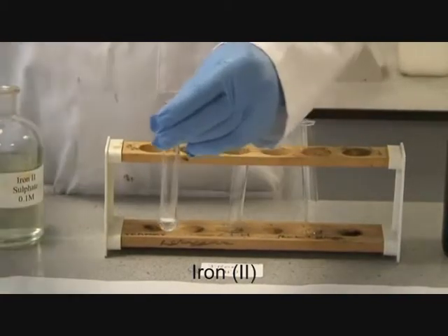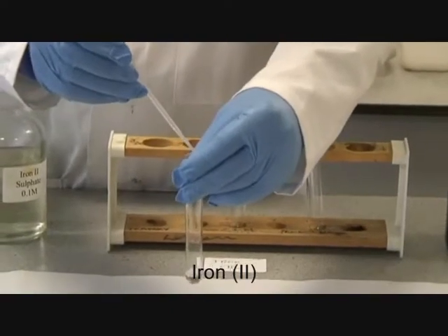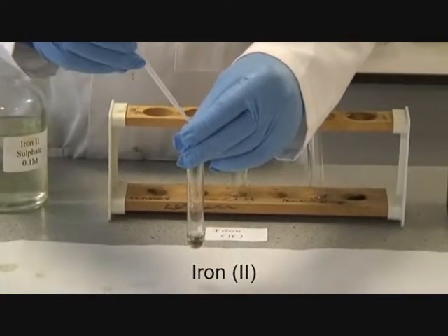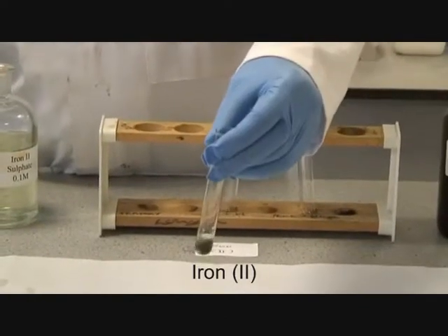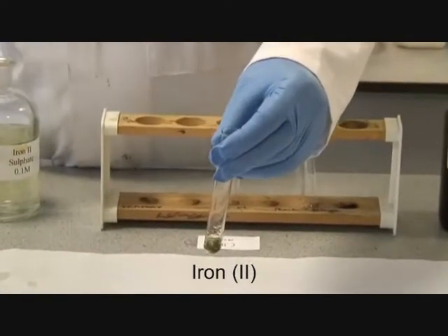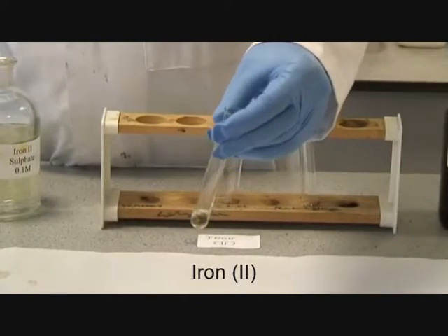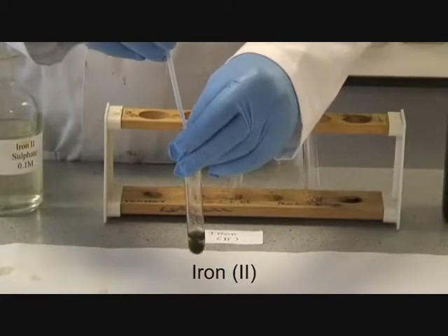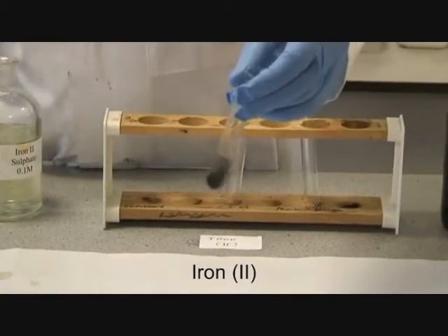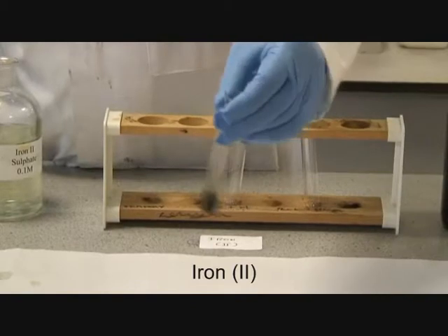On the addition of hydroxide, you must note what happens. You get a gelatinous green precipitate. The addition of more hydroxide just forms more and more of this green precipitate.